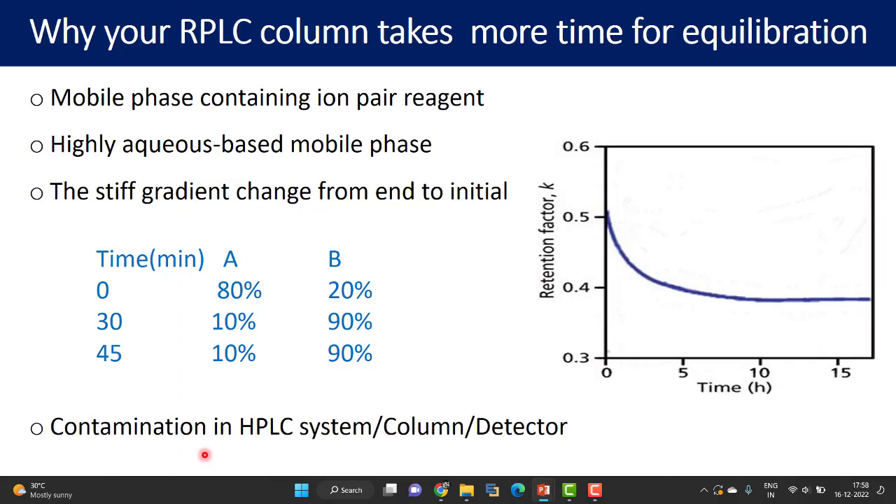Another important cause of longer equilibration time is contamination in the HPLC system — whether column contamination or detector contamination. Always maintain good chromatographic system flushing and cleaning practices. Whenever you complete an analysis, flush out all buffers and salts used during the previous analysis to keep your pump and lines free from any undissolved particles. That is the purpose of flushing the system, perhaps with a higher amount of aqueous mobile phase.